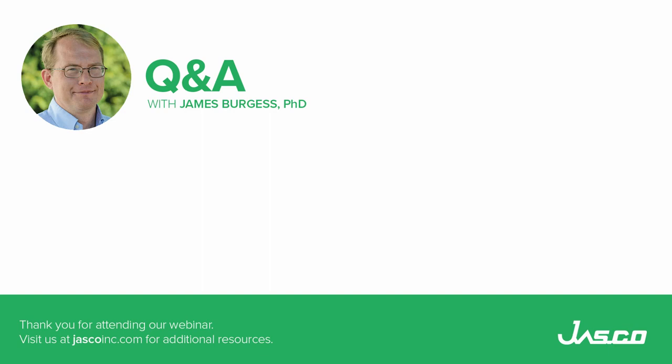James, can I answer one question that the same person asked and then asked me again to read? His second comment was like, please read my question. It's a question about microplastic particles, and he's asking about the different techniques, either FTIR or Raman. I have to say both techniques are vibrational molecular techniques. Both can be used for microplastics.